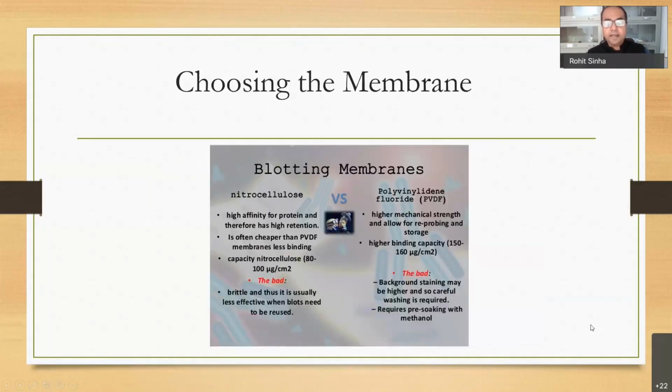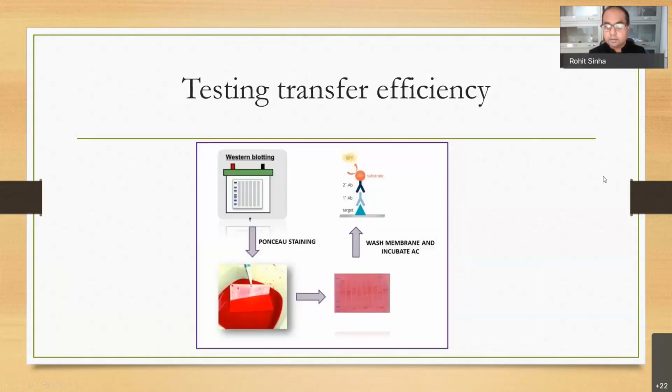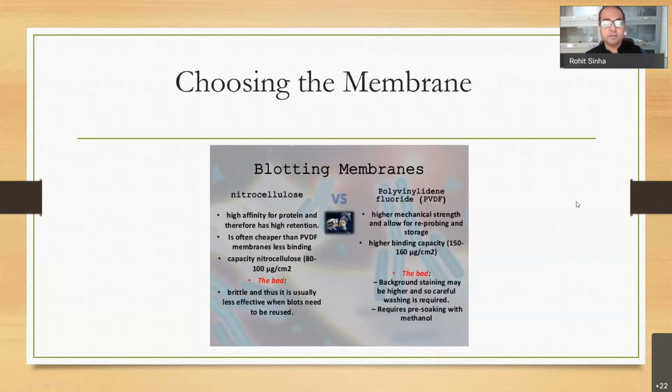Now, there are two different types of membranes which are used for Western blotting. One is the nitrocellulose membrane and the other is the PVDF membrane. We use both of these membranes regularly. It depends on what our interest is.